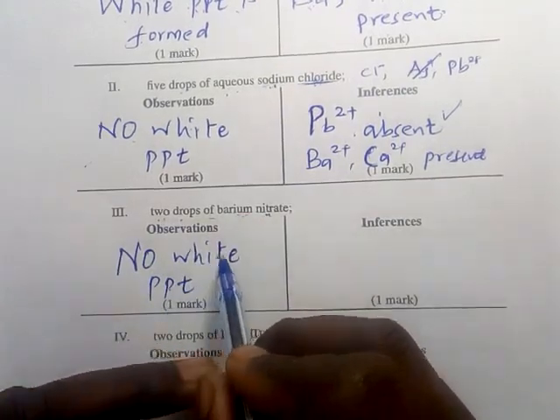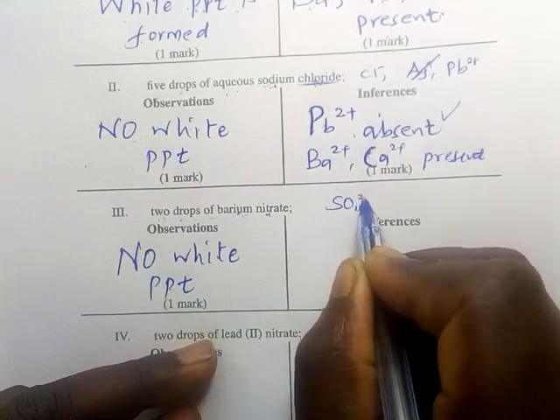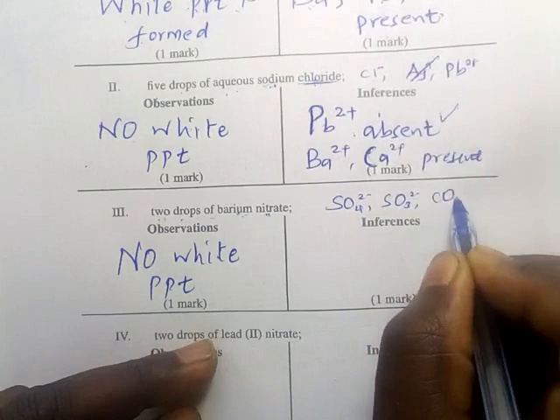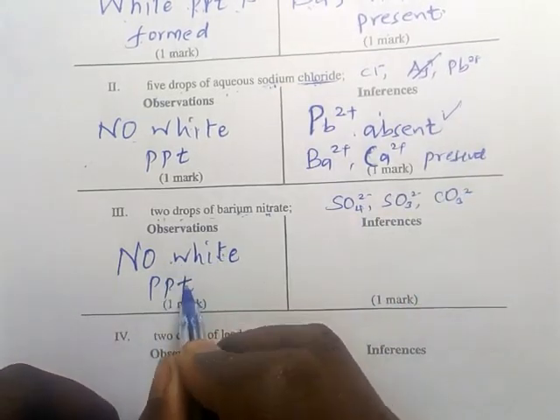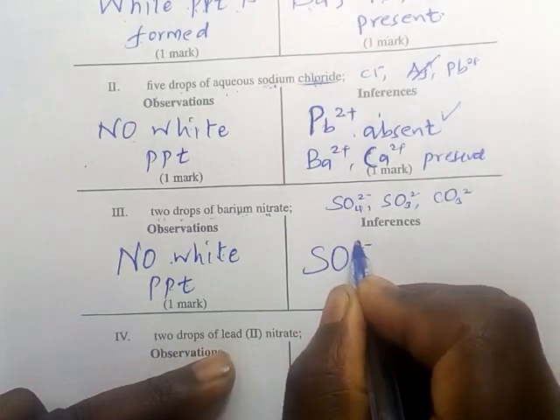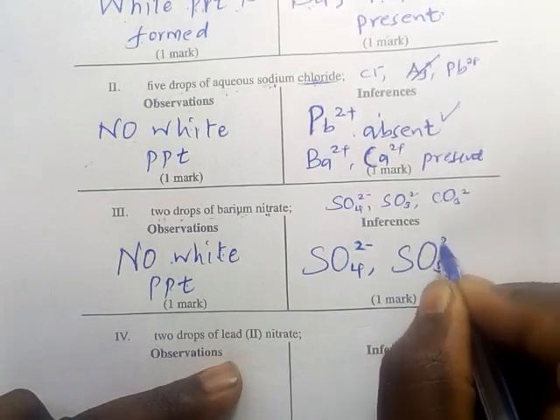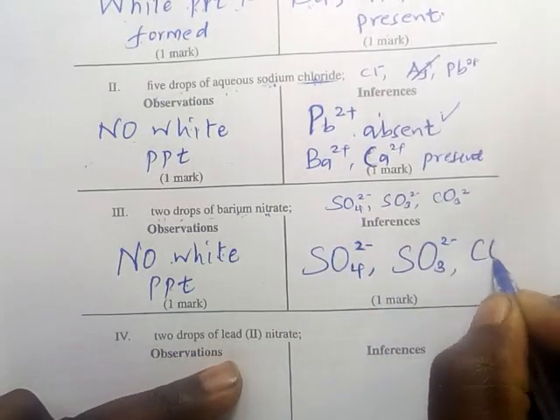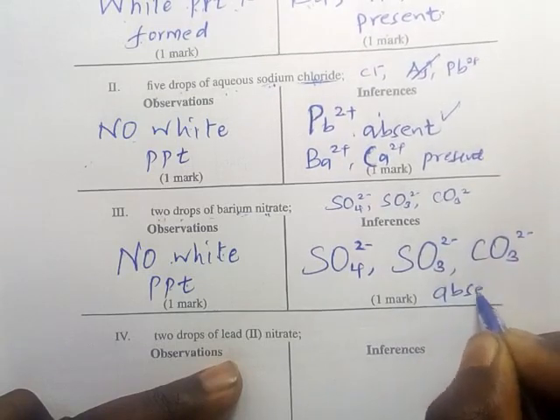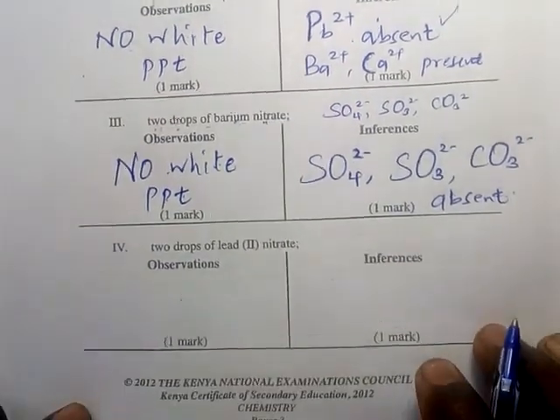If there is no white precipitate, and barium forms a white precipitate with the sulfate, the sulfite, and the carbonate, but there is none, it means that the sulfate, the sulfite, and the carbonate are absent. That's what it means.